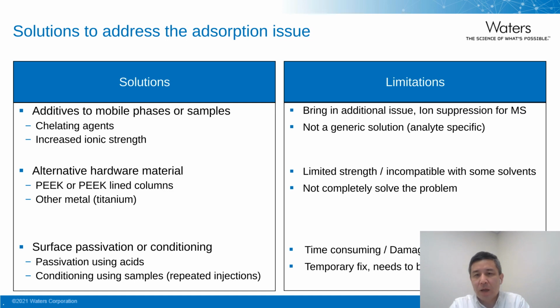Also, the additives sometimes work for one group of compounds but not for other groups of compounds. So it's an analyte specific solution. It's not a generic solution.